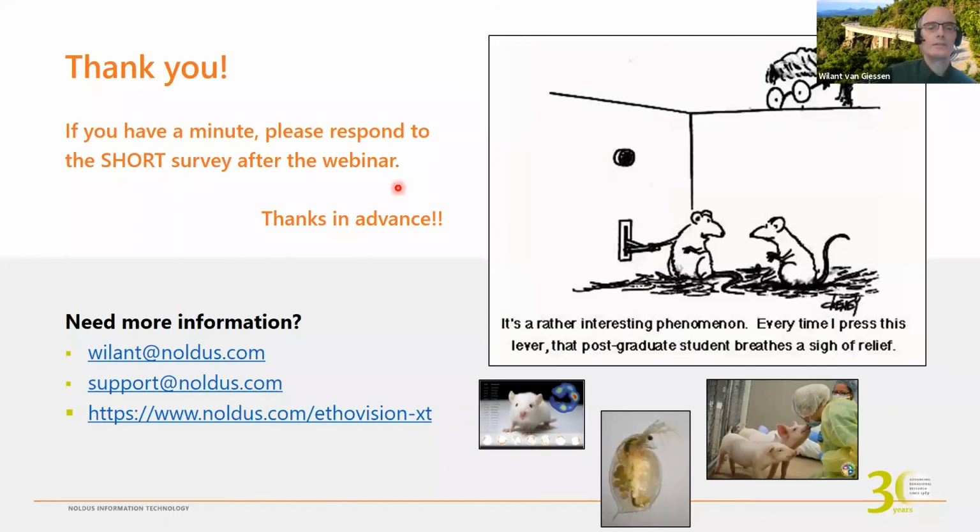And basically that's my presentation. That's all I had to tell you about EthoVision and how to analyze your data and export it all, etc. There's a short webinar survey afterwards. Please fill it in. We'd love to hear from you.